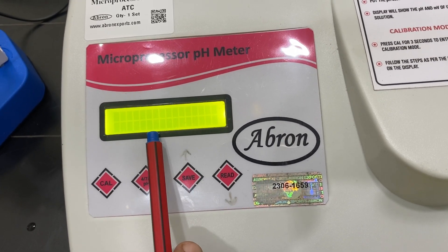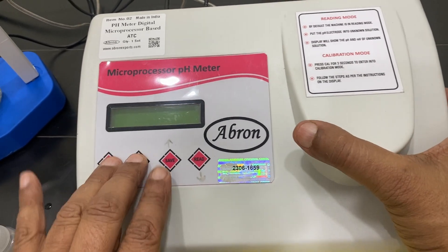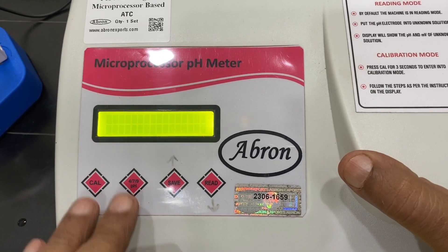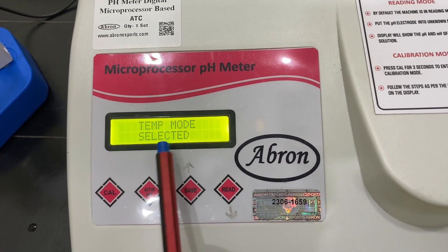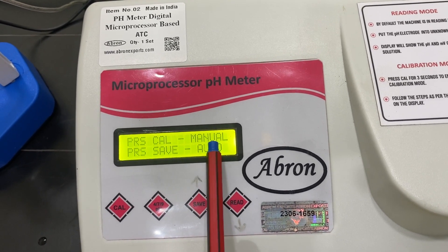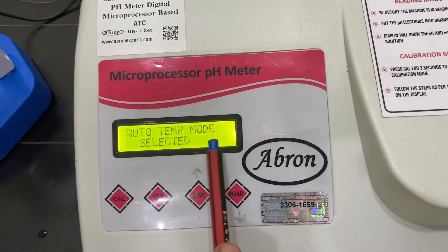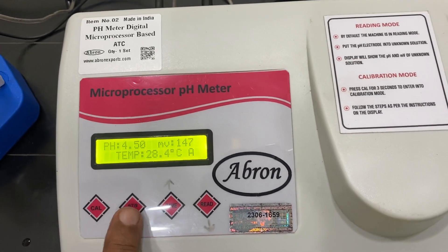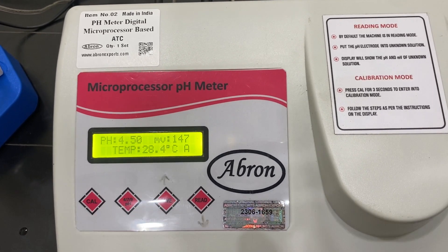The display says welcome, microprocessor pH meter, and the temperature is showing 28 point something. To access the mode: press both buttons, switch off, keep both pressed — temperature mode comes. There is a manual option: press scale to set manual mode, or press save to select automatic mode. Automatic mode is selected, welcome microprocessor pH meter.